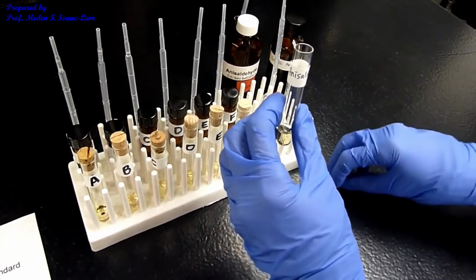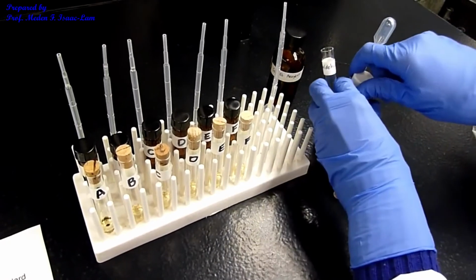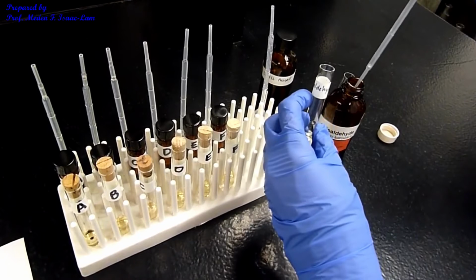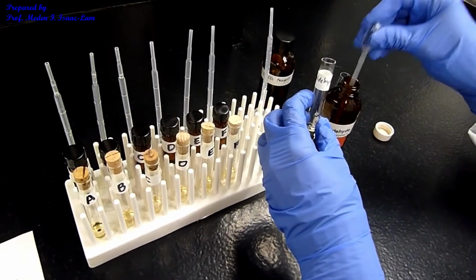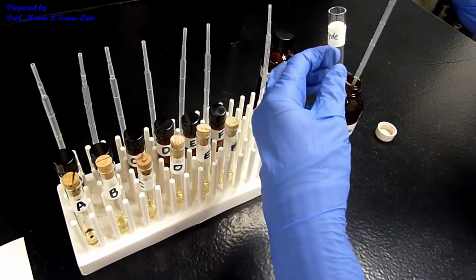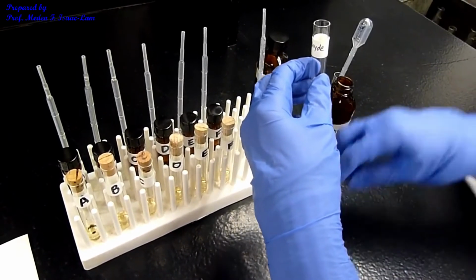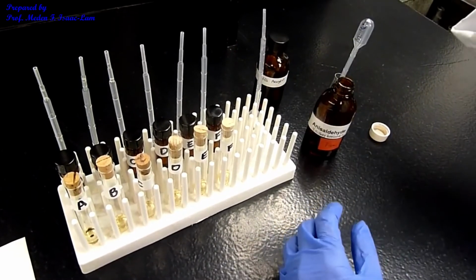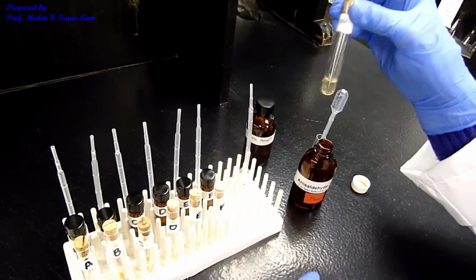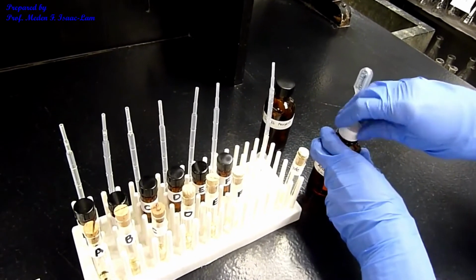So let's do the standard. So I will add 1 drop of the standard anisaldehyde. Then shake. Then let it sit.